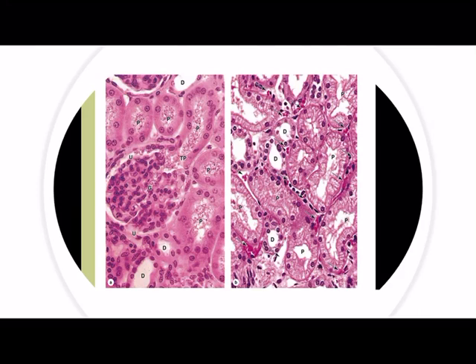Now, adjacent or near your proximal tubules would be your distal tubules. So we will discuss this. In order for you to distinguish between a proximal tubule and the distal tubule, because the distal tubule, remember, also sometimes will lie near your glomerulus at the vascular pole, the main difference would be that the inside of a proximal tubule will always look dirty, or it will always be filled.